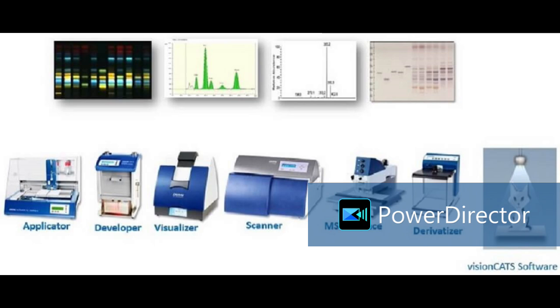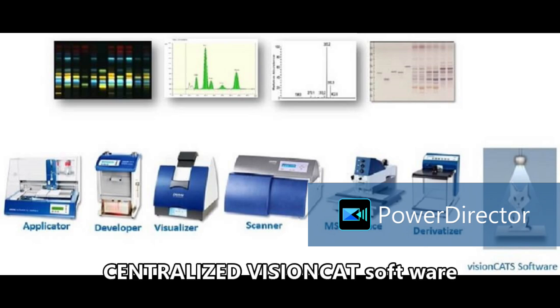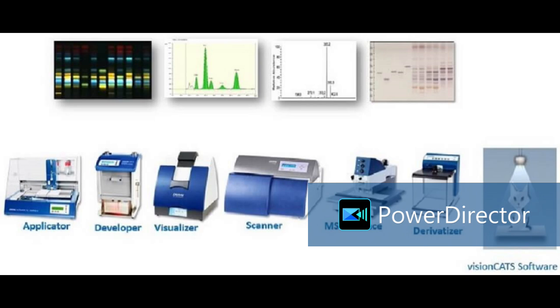Okay, clear? So it is connected to centralized software, that is VisionCATS, the latest system control software. All these modules we can operate through the software, and we will get a complete analysis report with plate images like this. This is the plate image under 366 nanometer. This is the chromatogram for quantitative analysis.